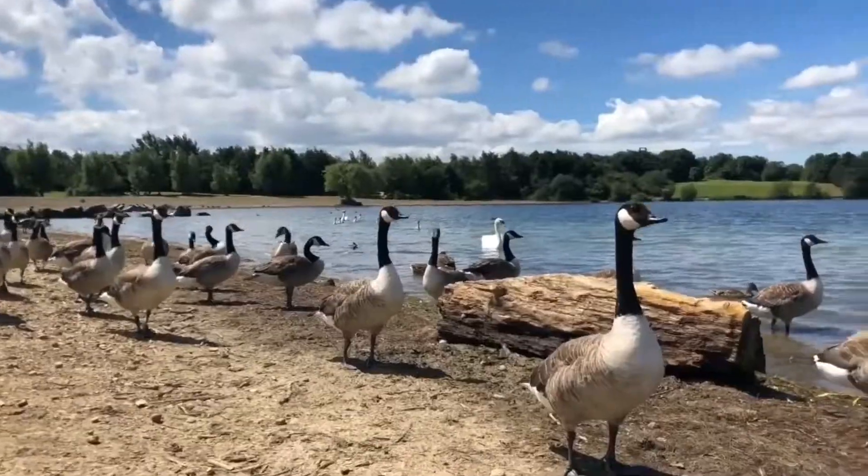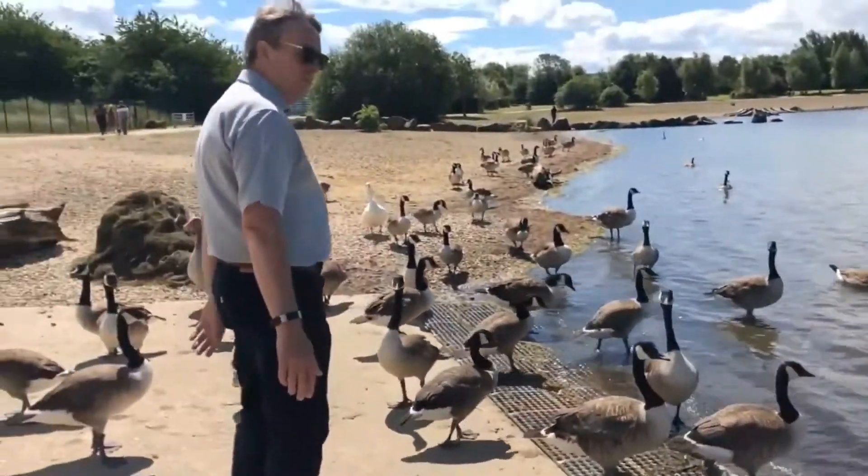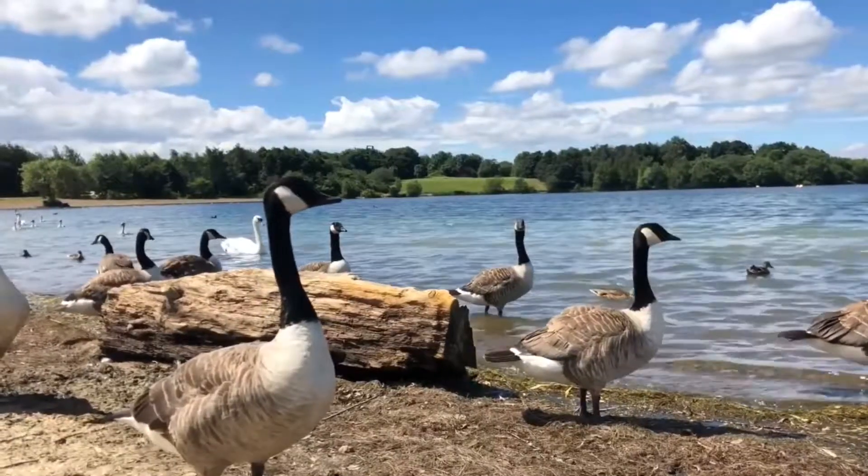Hello, it's Ben from MarTech. Today we're at the lake. We're going to show you how we're going to do the sewage effluent testing. I'm sure many of you have already seen our brochures and the e-book about it. Let's actually show you it in action.